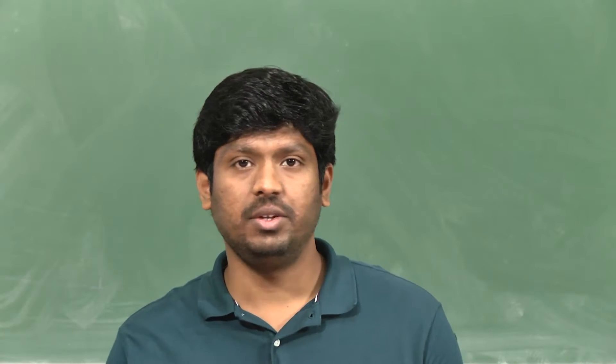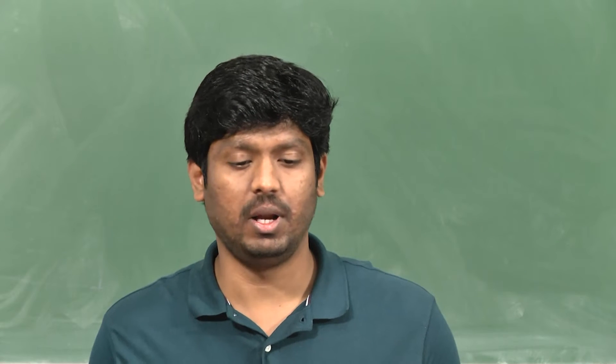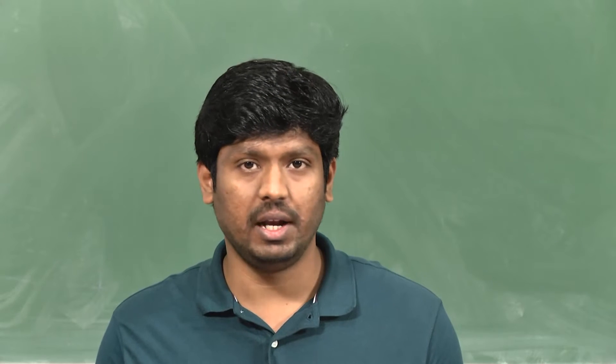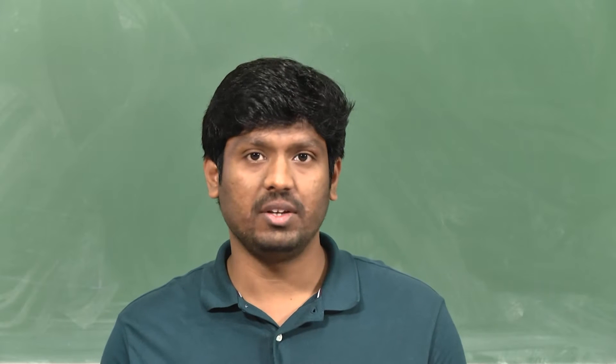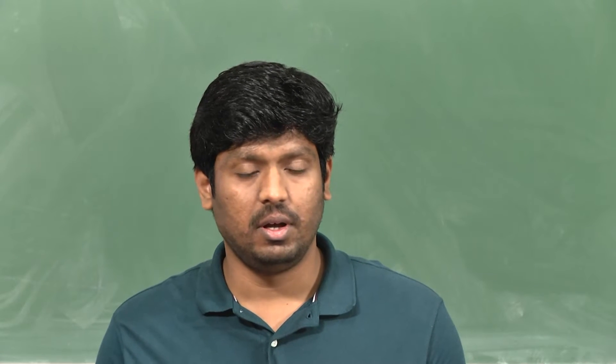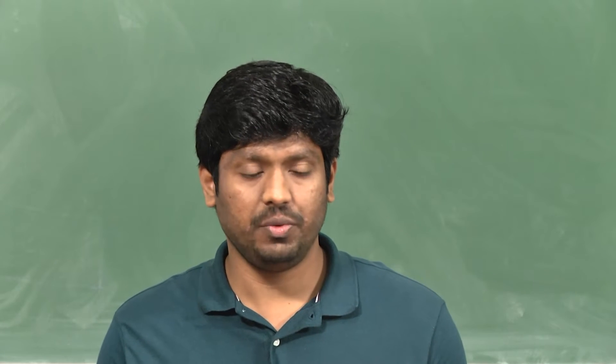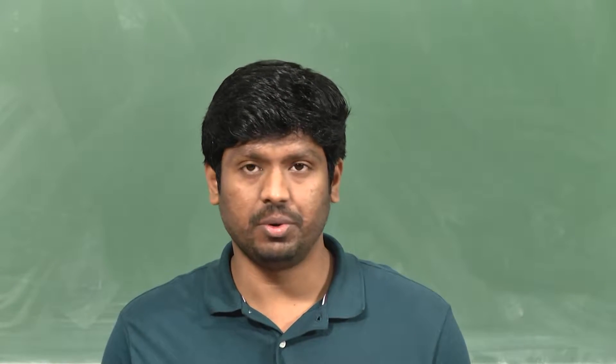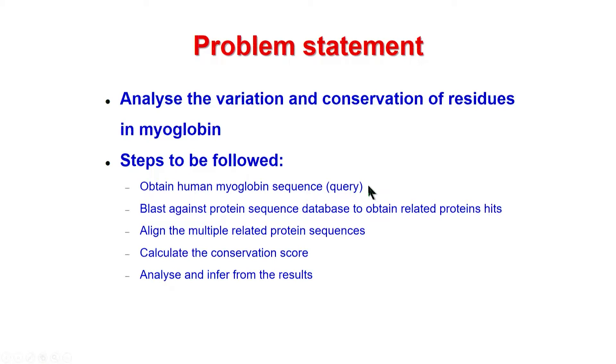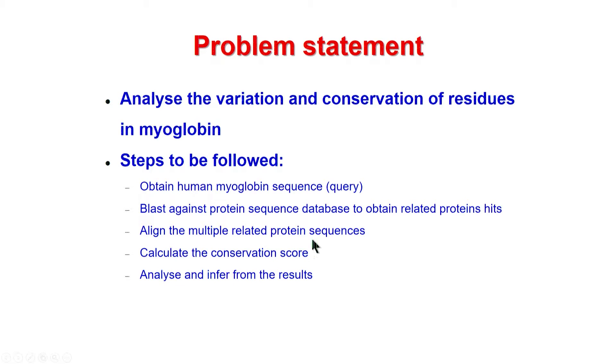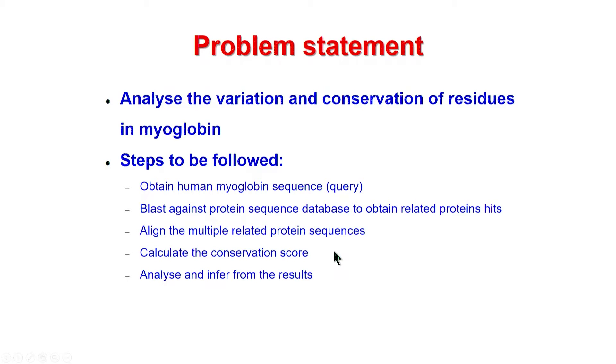In this exercise, we will use BLAST, ClustalW and AL2CO to calculate the conservation of myoglobin. We will start by obtaining the myoglobin primary sequence from UniProt, followed by blasting it against UniProt to get the related proteins. Further, we will use these sequence results to obtain the MSA, multiple sequence alignment. From the multiple sequence alignment, we will calculate the conservation score for each residue position using AL2CO. Further, we will analyze this and infer from the conservation results.